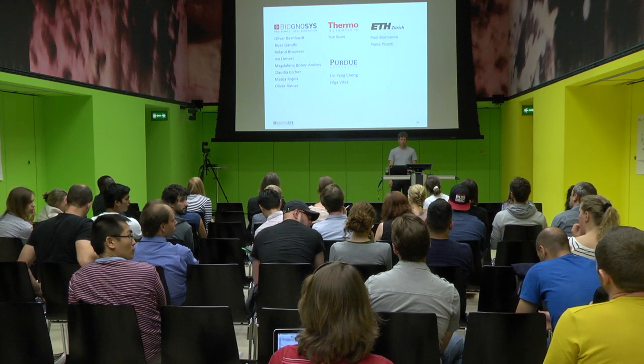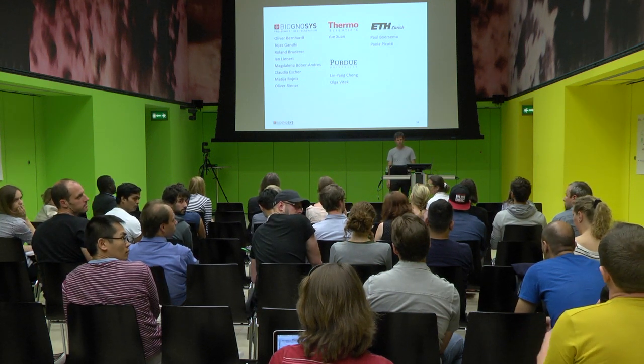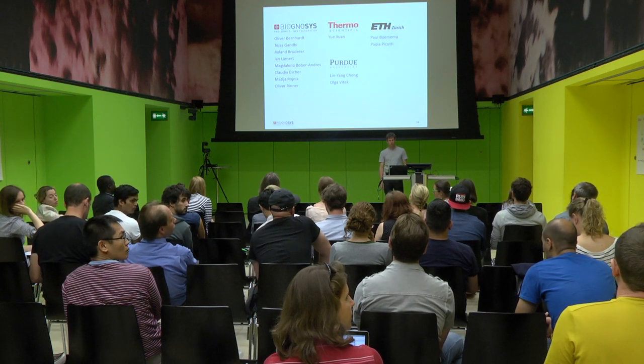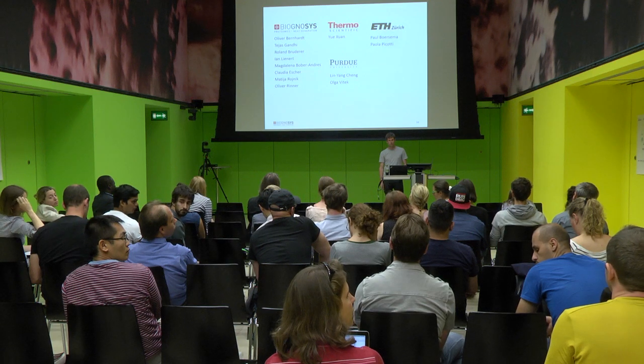Regarding the libraries, you generate the libraries in a kind of sample-specific way, right? Your library matches very well the samples you're going to inject in DIA mode. Have you tried using larger-scale libraries? Something we talked about earlier was the effect on the false discovery rate at the protein level when the target prevalence is lower. Is this something that you have thought about, or have you tried some big libraries? Is it supported in Spectronaut?